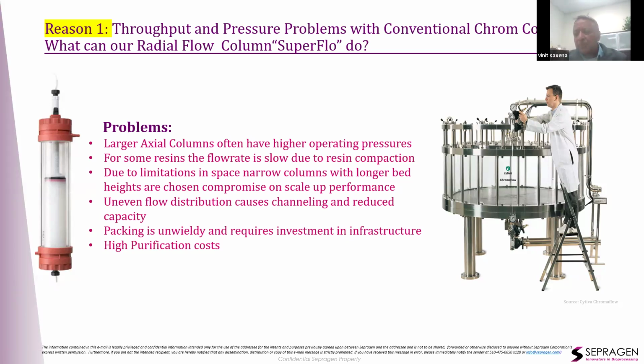But what's the reason for the 20 centimeter bed? Well, we don't have a reason. But that gives you a good residence time. Oh, okay, so you scale up with equal residence time? No. But you keep the bed height the same. Okay? So no, there's no rationale.